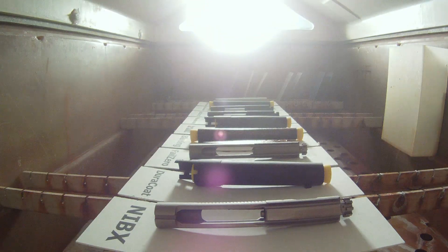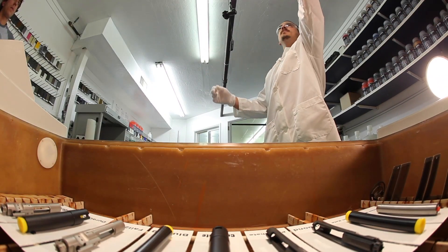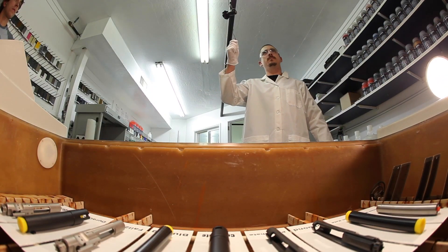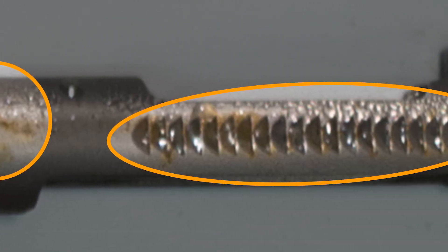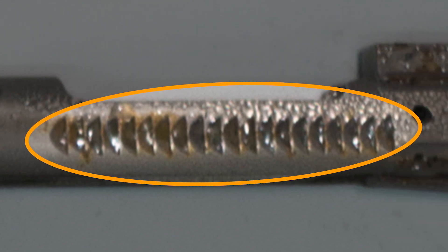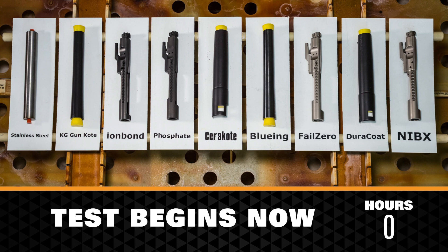Rust appearing on the white panels holding each part does not necessarily indicate first signs of corrosion. The salt chamber recycles the salt water, which picks up rust in the atmosphere and deposits it on surfaces throughout the test chamber, which can give the false impression that corrosion has begun. First signs of corrosion are noted when the test components show numerous areas of corrosion from non-deposited rust. The test begins now.